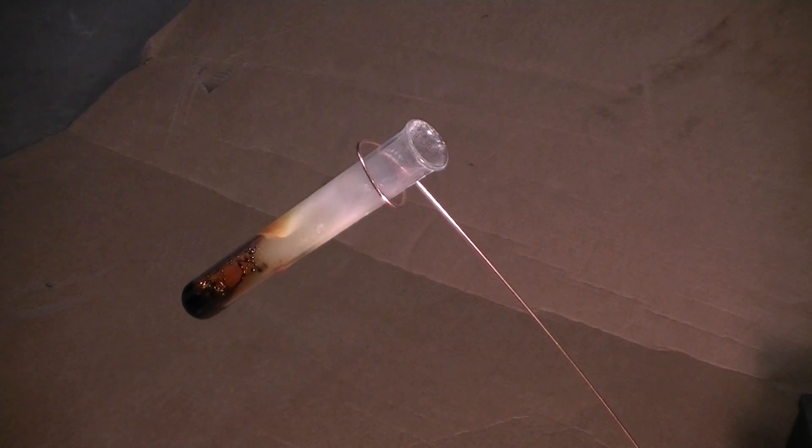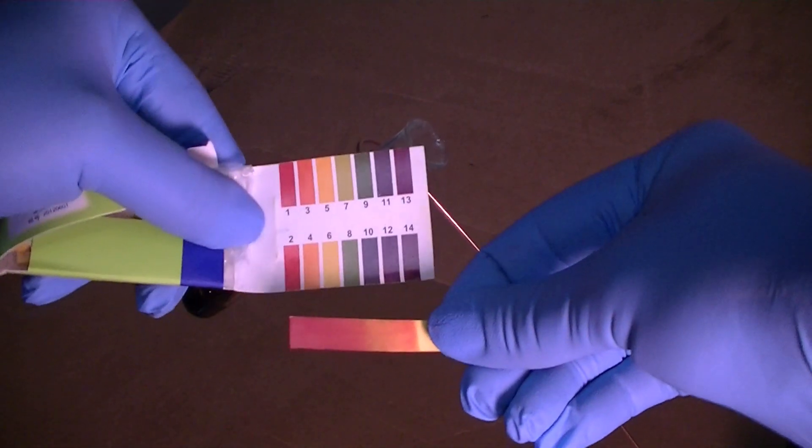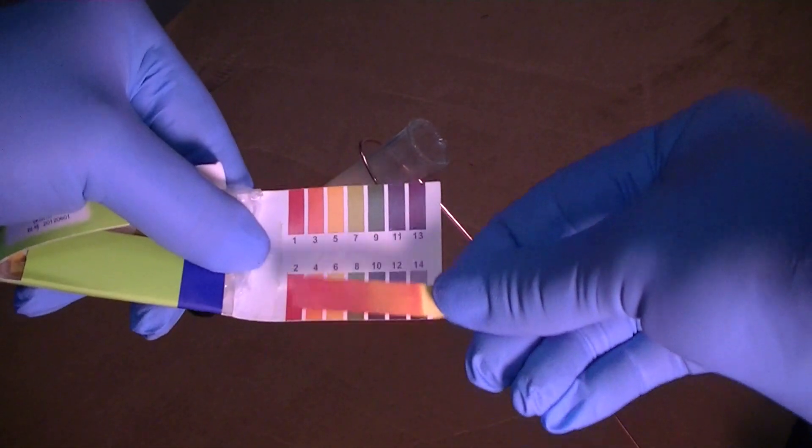Looking at a color chart confirms that a red color has a very low pH of around 1, which is acidic.